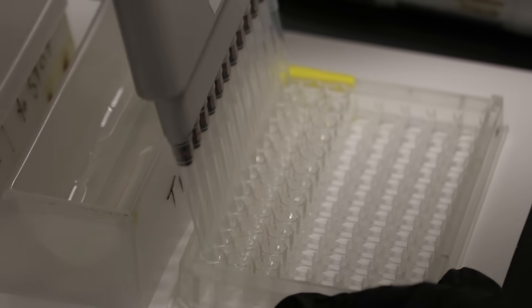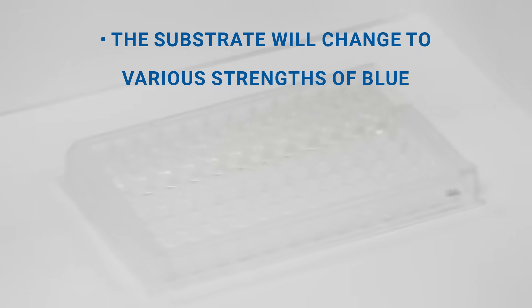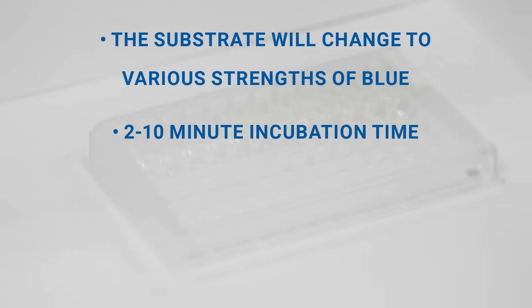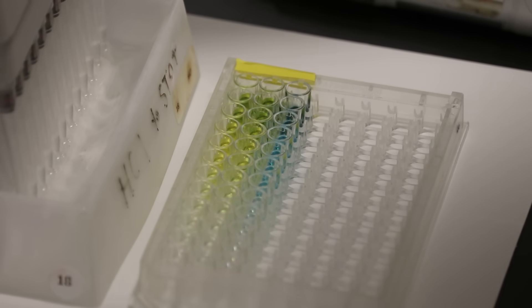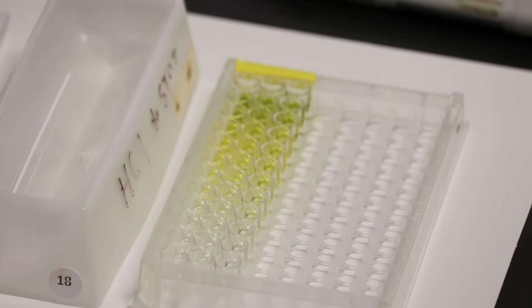Add the TMB substrate to all wells and shake the plate for proper incubation. Note that the substrate will change from colorless to different strengths of blue. The incubation time for this step should be between 2 to 10 minutes, as noted in the instructions. Watch the plate for color development. Once the color develops, quench the reaction by adding stop solution to all wells when samples are visually in the same range as the standards. Be sure to add stop solution to the wells in the same order as the substrate, upon which color will change from blue to yellow.